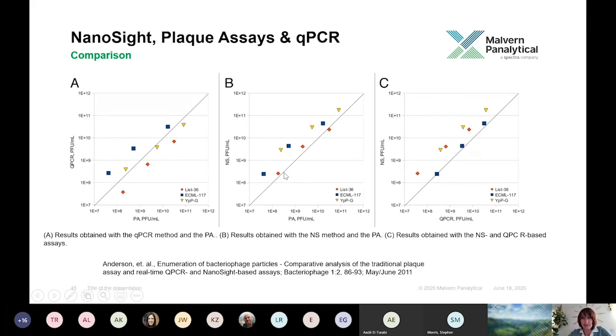And this is similar to DLS, the same as what Mike said for DLS. Remember that both DLS and NanoSight NTA techniques count the particles, the total number of particles. So we will be counting those that are full, those that contain some nucleic acids, that are infectious, non-infectious, as well as many contaminants that might be detected in a sample. That will include the cell debris, sample impurities.